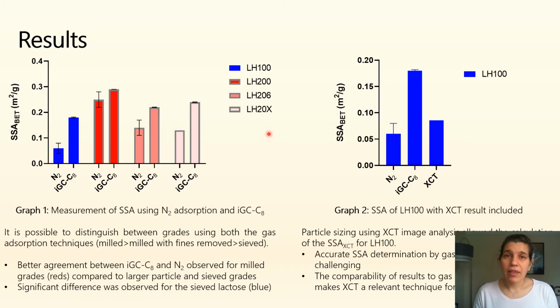In brief, the results are that both of the techniques were able to distinguish between the different grades. There was quite a good agreement between the IGC and the nitrogen adsorption, although, as I said, it's hard to get a direct comparison between the techniques.